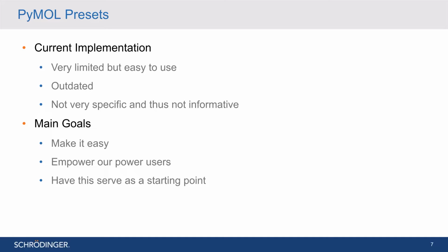There may be a very particular way that you want those membrane proteins loaded in, because as I'm sure we all know, there are certain regions within membrane proteins, or maybe just the membrane itself, you want represented in a certain way every time. So that's the first component, having a preset that is just your default load-in starting point before you do any other additional styling or changes.